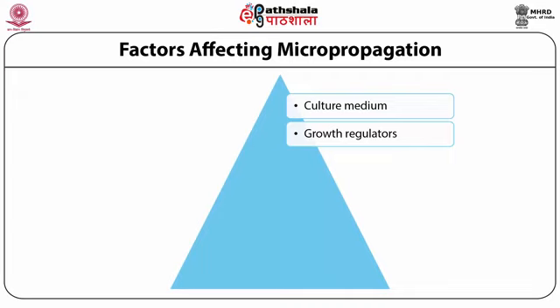There is no relationship between the requirements of the plant outside versus what it requires in cultures. So tissue culture is more of an art. You start with broad categories: low salt, medium salt, and high salt. And then you decide on what kind of media constituents the growing culture requires. MS media is most widely used, but it is not universal. For woody species, we also use different concentrations of MS. We reduce salts, both major and minor.